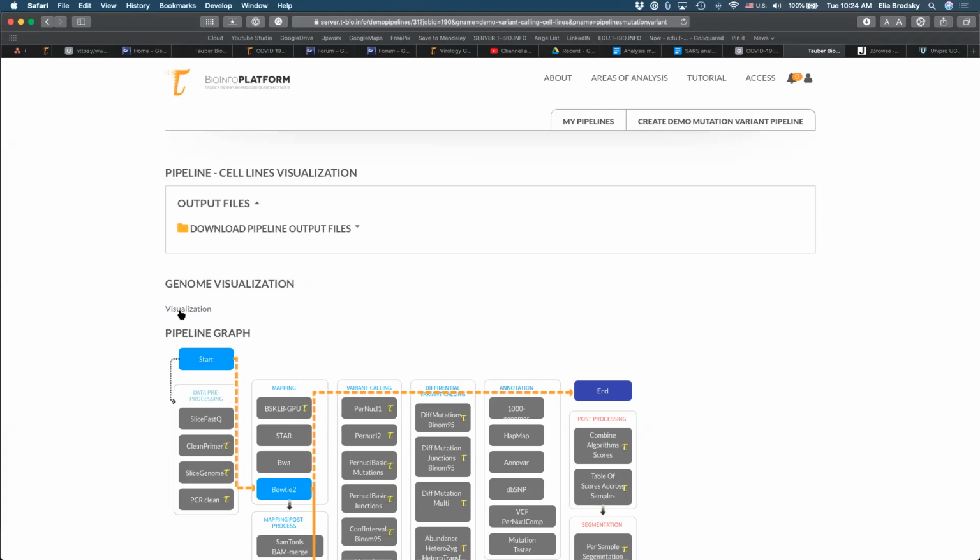All right, great. When you click on visualization, you'll be able to see that visualization that we were looking at, and you'll be able to explore by zooming in, zooming out, changing the chromosome, and focusing on a specific portion of that genome. Okay, so another option, let's do this together.